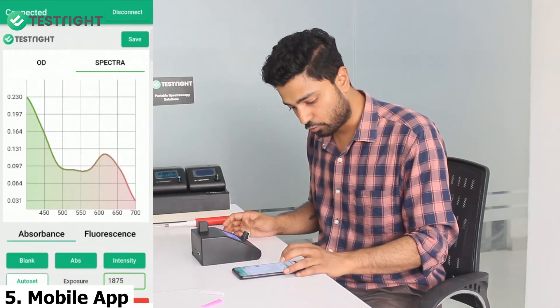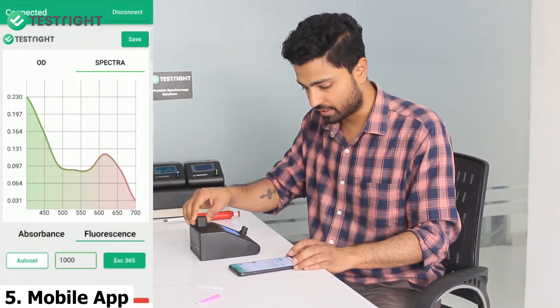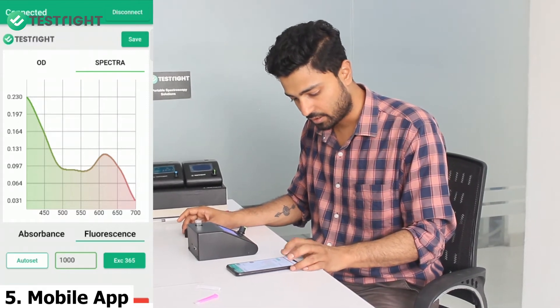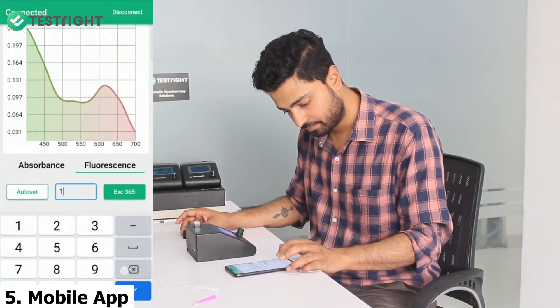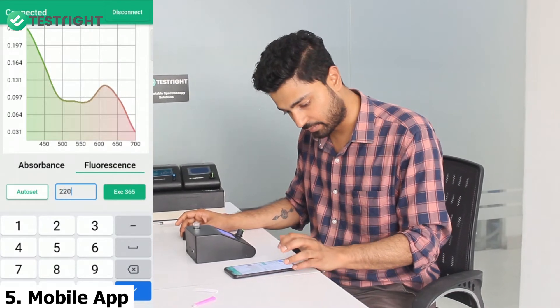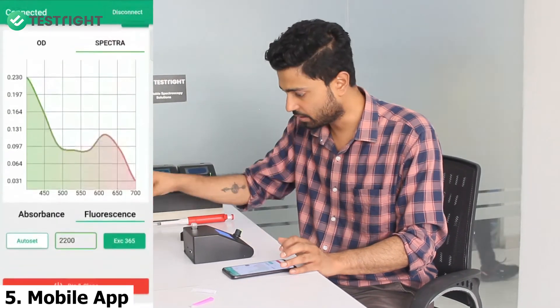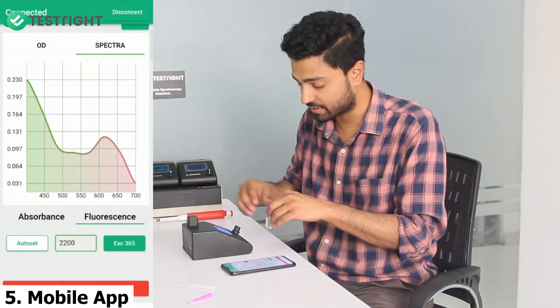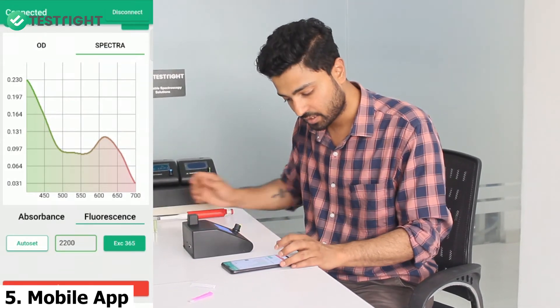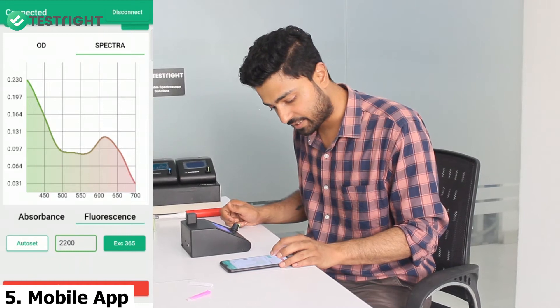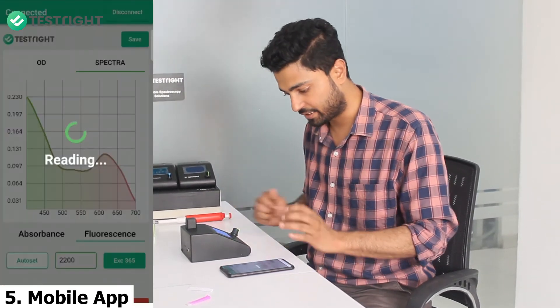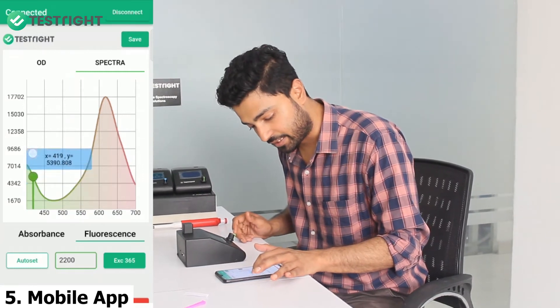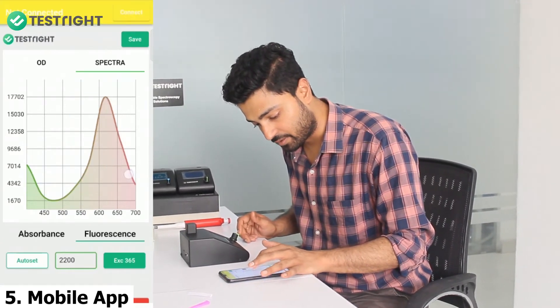You can further move into the fluorescence mode and set the integration time or the exposure time here. Let me put it at 2200 milliseconds and insert the fluorescence sample. I click on the excitation 365 button to take the reading. There you are with the entire emission graph.